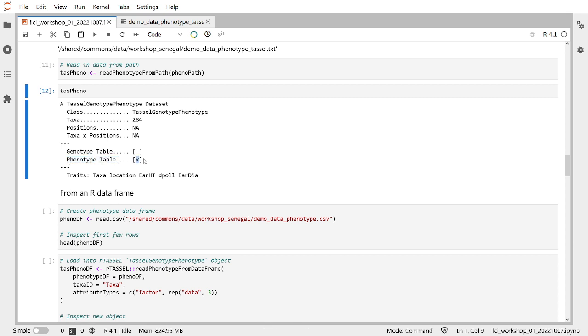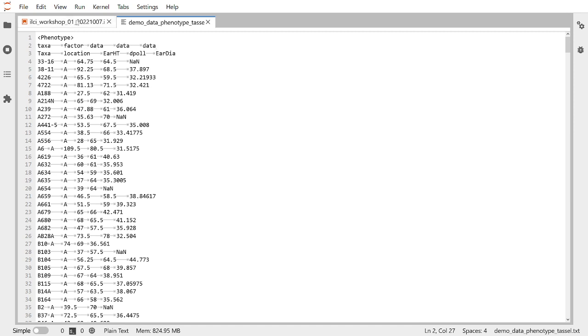And we can see we have a little X to show that this component in this object has been populated with this phenotype table. And then we have an additional message below that genotype and phenotype table that indicates what are the traits that are found, or basically a better way to describe this is what are the different columns that are being identified within this data set.